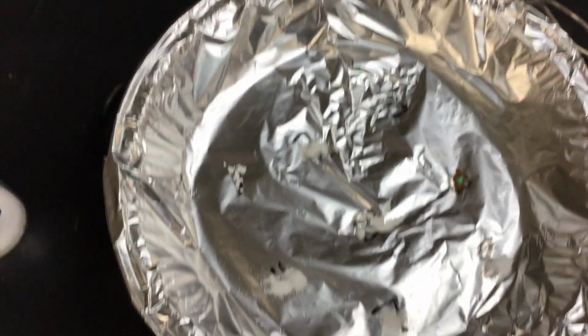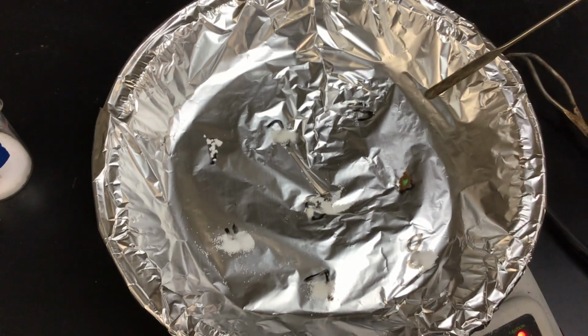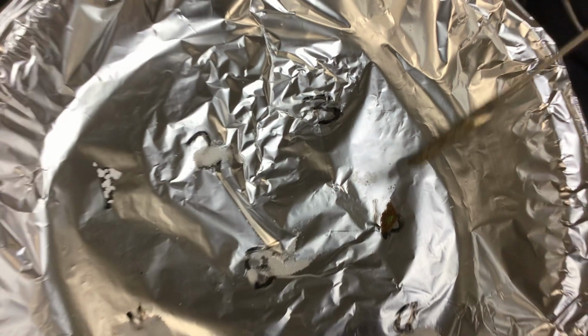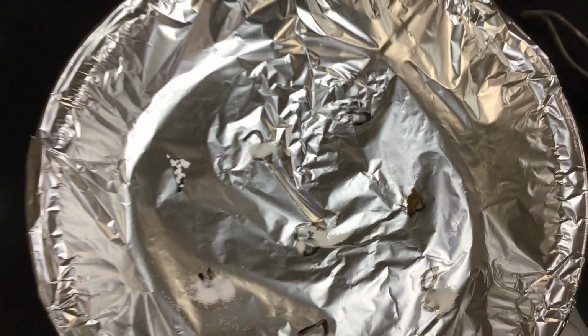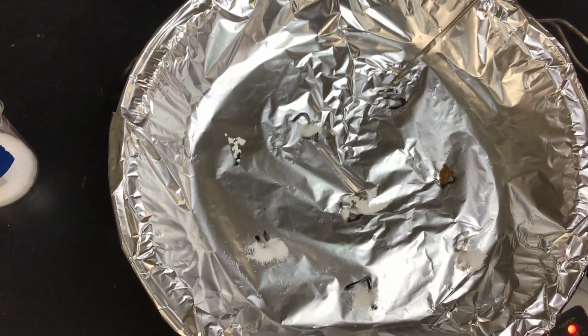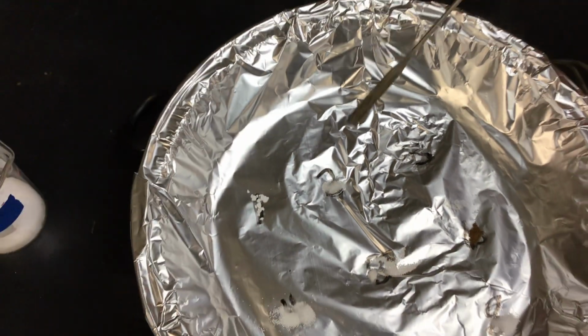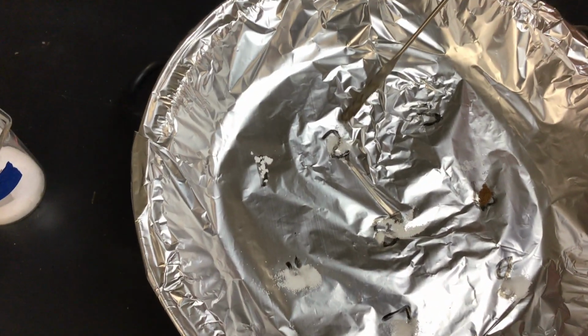So now we're going to look to see which one melts first. Now I already see that number 6, if you can tell right here, number 6 is melting. Number 3 has melted. I think number 3 actually melted first. Okay. Number 2 is starting to melt.